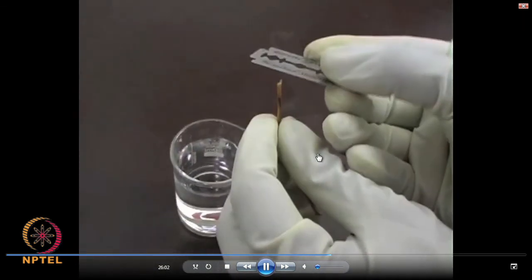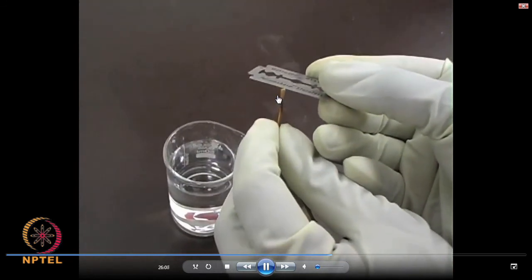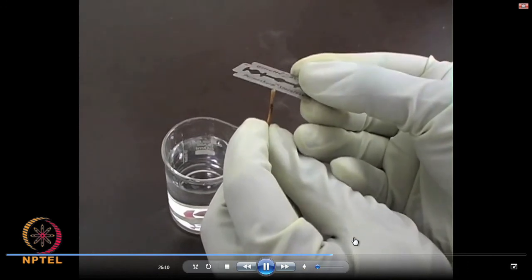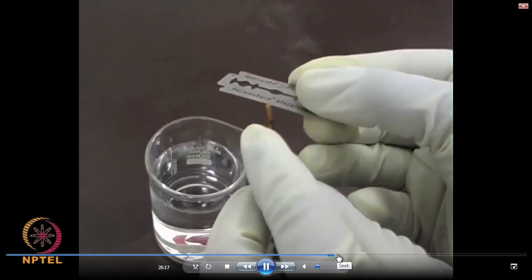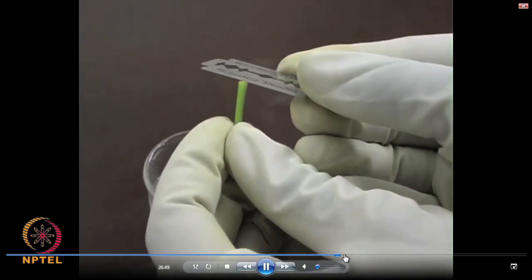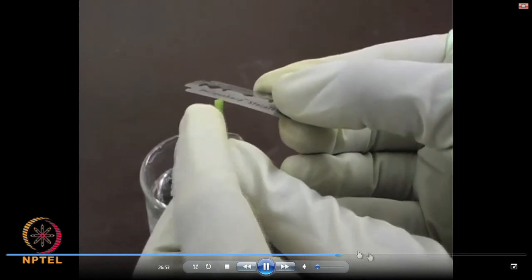You just take the stem and then it is sliced by the razor blade to the smallest possible thickness, and then you are supposed to put it in floating water in the beaker. So, let me speed up this activity. This is done for the money plant stem now.